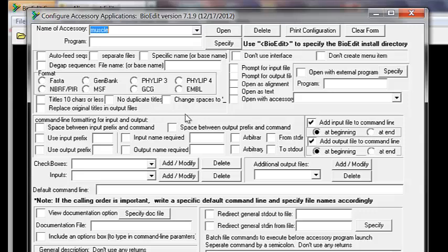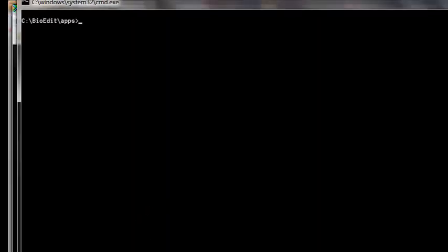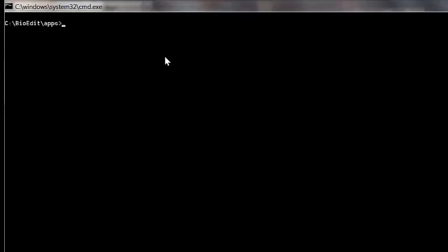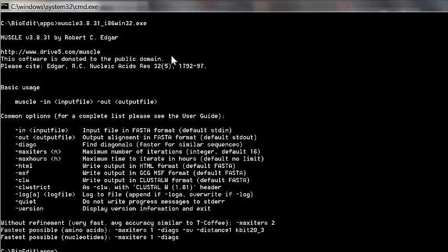Before we set options, let me show you how the program runs in the command line. I've already navigated to the BioEdit Apps folder. If I type muscle.exe it gives the help, showing that basic usage is: type 'muscle', then use the flag '-in' with the input file name and '-out' with the output file name.